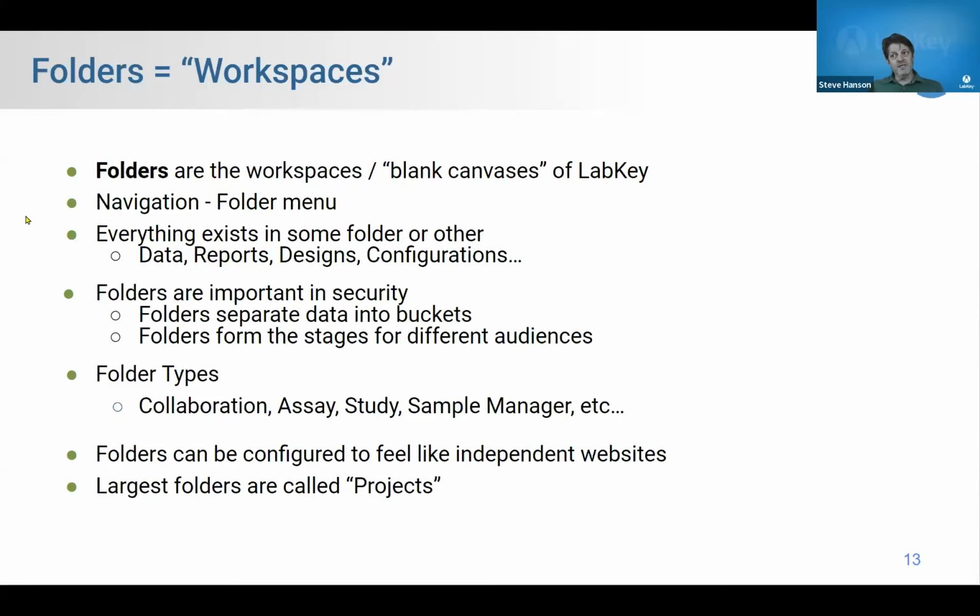Folders also come in different types. Some of the folder types are collaboration, assay, study, sample manager, biologics, they go on. Different folder types are for different domain purposes. Again, folders can be configured like different websites, essentially.